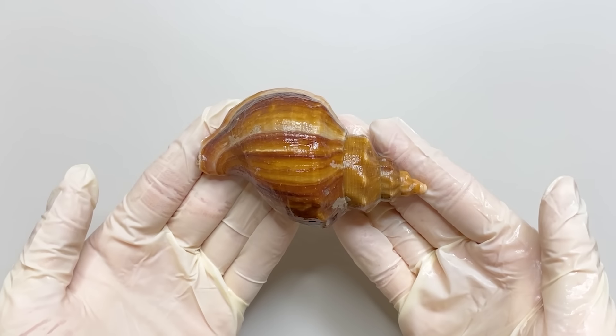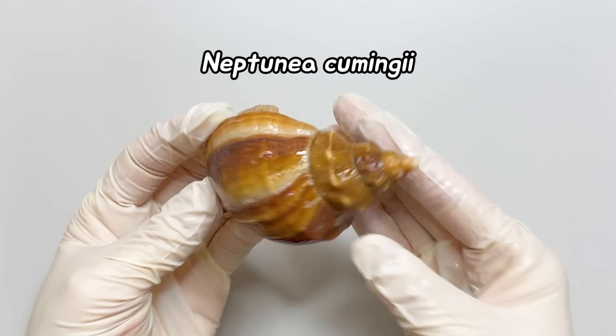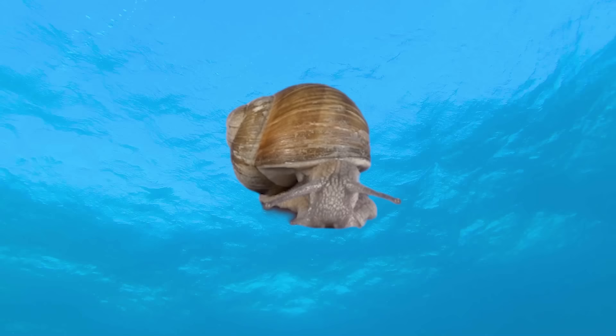Today, we will dissect the whelk. Whelks is a marine gastropod mollusk belonging to the family Buccinidae, commonly known as sea snails.